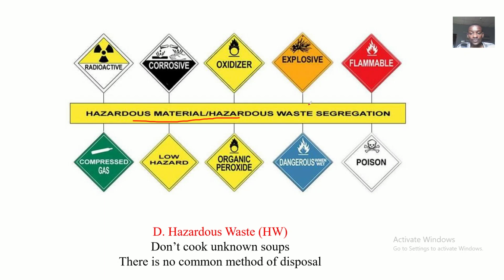The different types of hazardous materials and hazardous waste we could have in the laboratory include radioactive waste, corrosive waste, oxidizer waste, and waste that could cause explosions. Then you could have compressed gas, which when you open it can explode. Do you understand? So that's all.